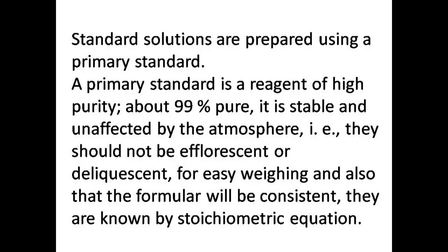Standard solutions are normally prepared using the primary standards. Primary standards are reagents that have high percentage purity of, say, 99%. They are stable. That is, when exposed to the atmosphere, they remain stable. They are soluble. They are known by known stoichiometric equation. Now, standard solutions are used to determine the concentration of other substances whose concentrations are not known.